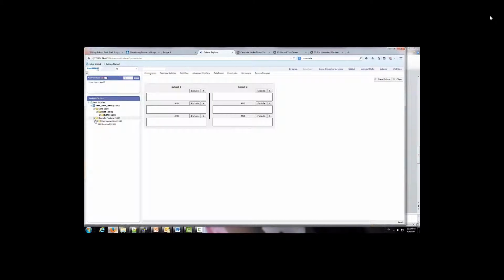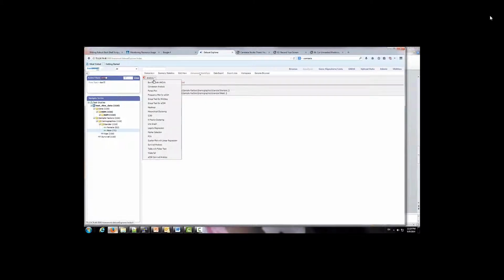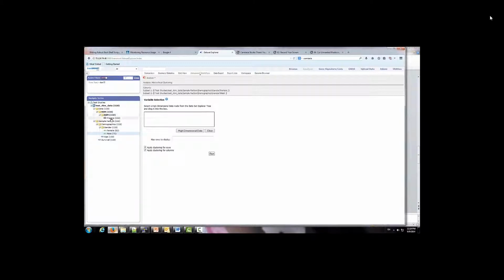The new data types are the mRNA-seq, microRNA-seq from NGS and qPCR, and proteomics data from protein mass spectrometry and immunoassay from RBM, and also the metabolomics data, which are the quantities of metabolites.